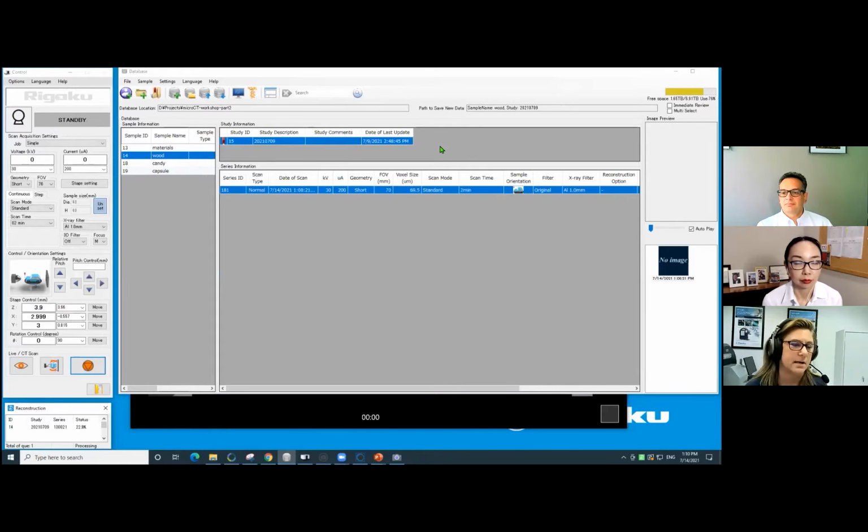Maybe the contrast might be challenged. And that's the hard part about organic samples, is the limited contrast. And in this case, we're going to see that in just a second. That's our challenge. Now, it is possible to improve contrast for these types of things. And because this is no longer alive, we could have stained it with something. And of course, if something is living, you don't want to do that. It's possible that the stains themselves can be toxic.